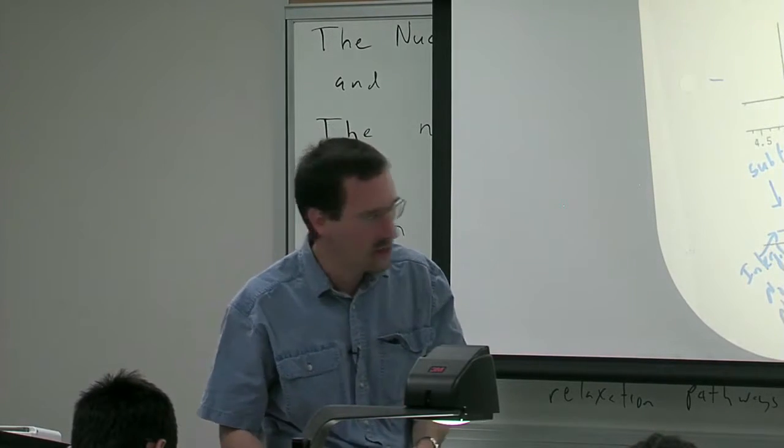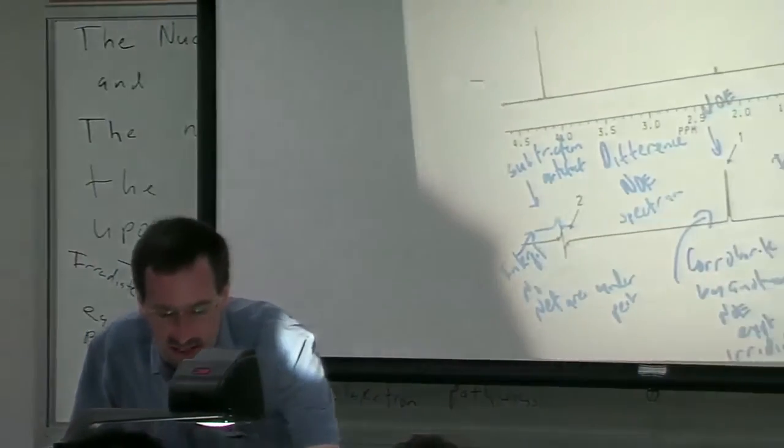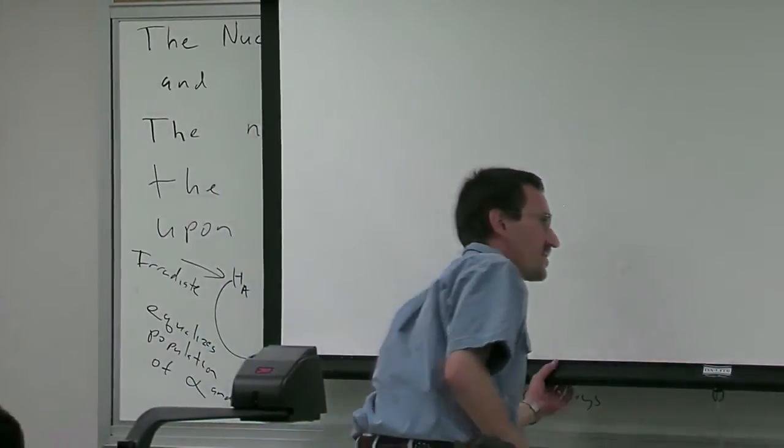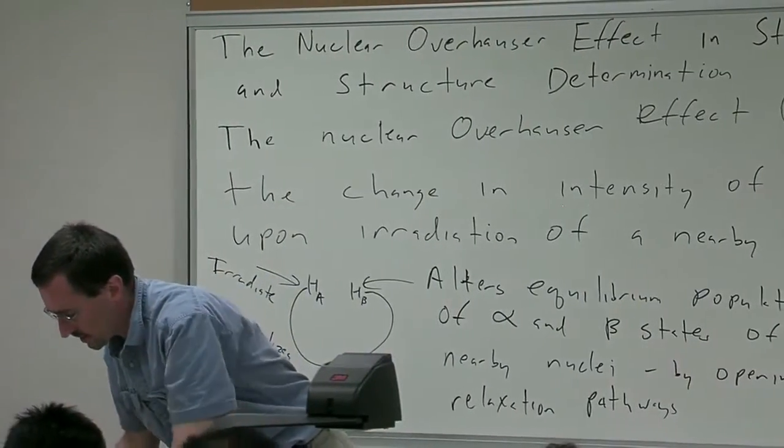You will also do a NOESY experiment. But the 1D NOE is a beautiful experiment because you can probe very specific questions. So this is kind of a textbook example.